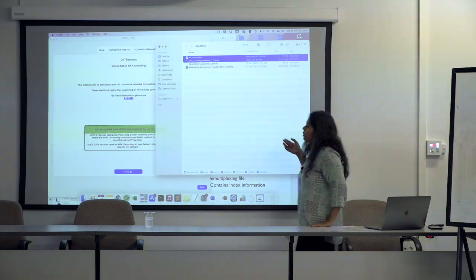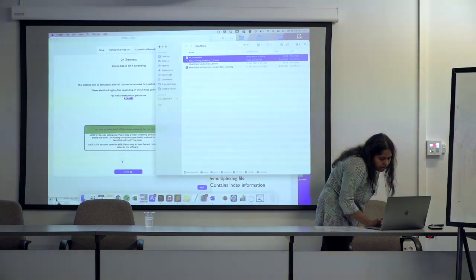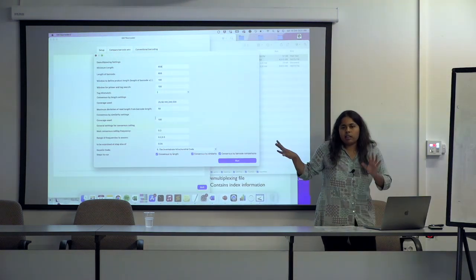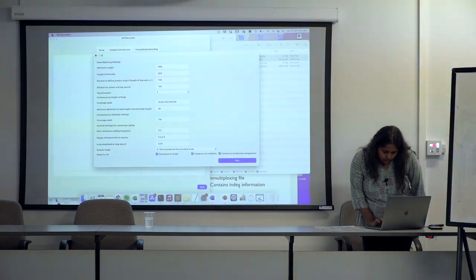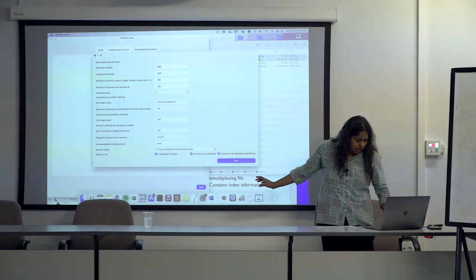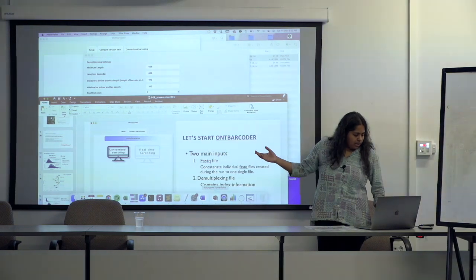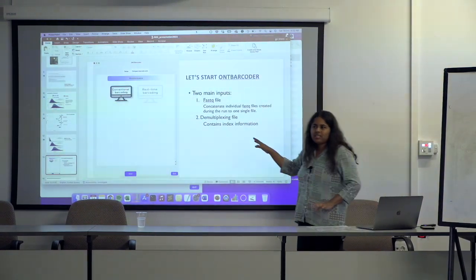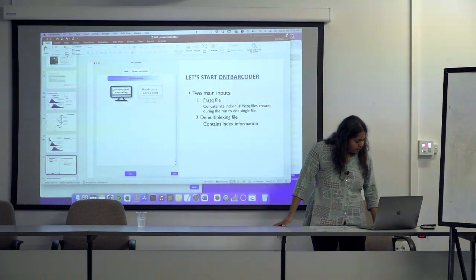It will open up a dialog to show the various options. I can go through each of the options in the slides, but you can also feel free to start the run or wait till the slides are over. The analysis is quite fast for this data set because it's quite small.